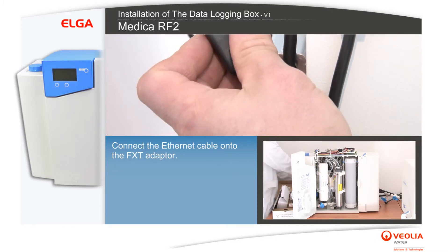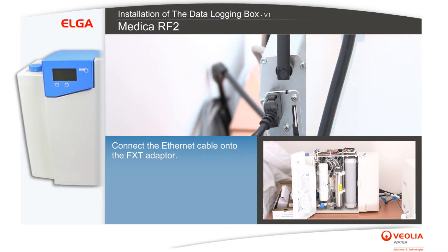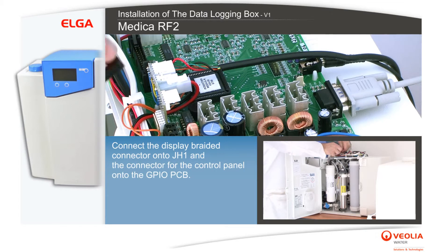Connect the Ethernet cable onto the FXT adapter. Connect the display braided connector onto JH1 and the connector for the control panel onto the GPIO PCB.